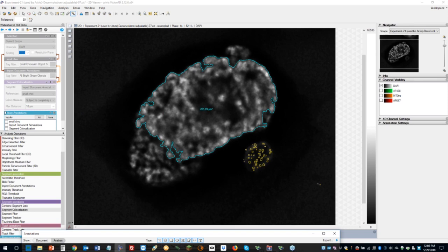I just started to work with some time series earlier this year, collected in DIC. There's a wide field or bright field and DIC. At first it was new for me, but I figured out the motifs basically. I have some ideas, and I'd be happy to sit down and work with you in a web session and show you some of these motifs. I tend to use the trainable segmentation, so a bit of machine learning, a bit of morphology and a bit of filtering in various motifs in order to catch the cells from the DIC images.